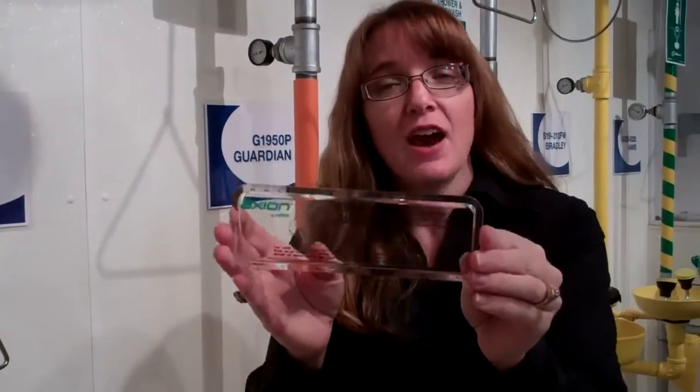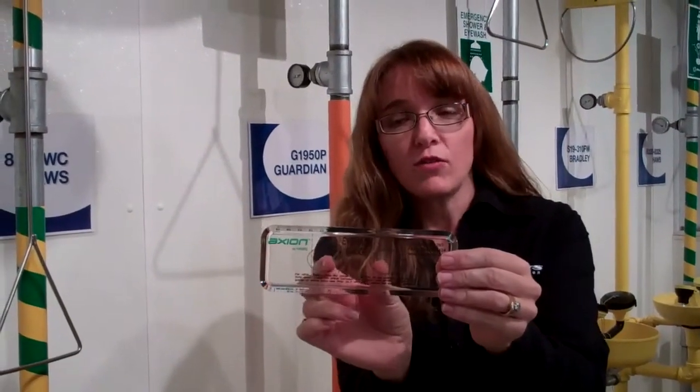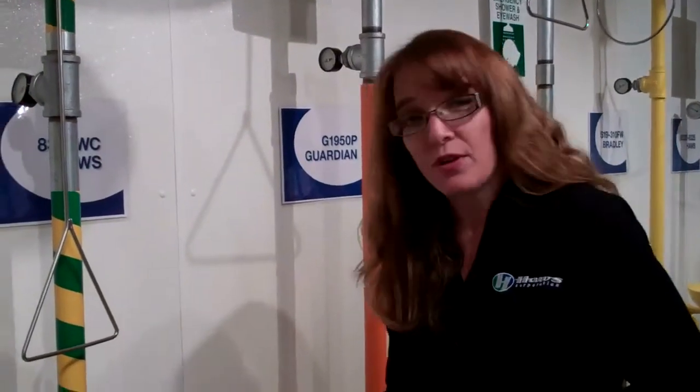ANSI Standard says that you should use an official eyewash gauge and that when you are testing the flows, the two points of water should reach these two spots here no more than eight inches from the head. We're going to show you how that works.